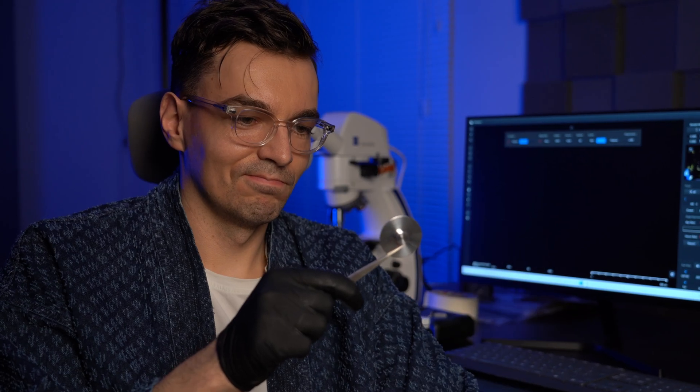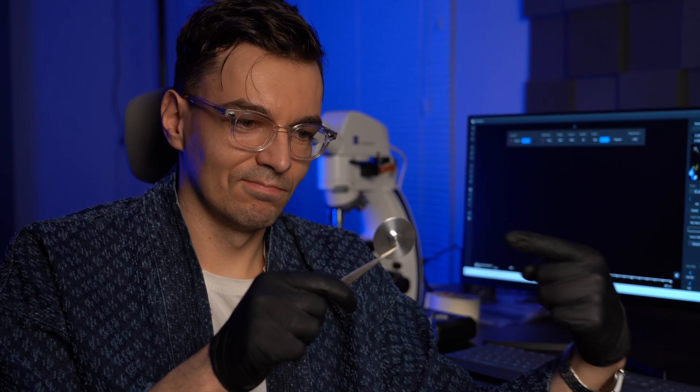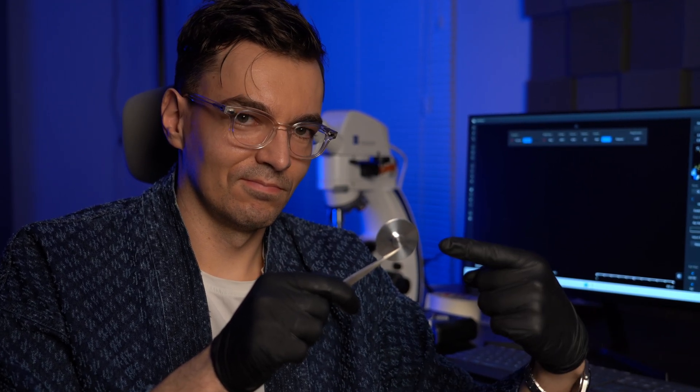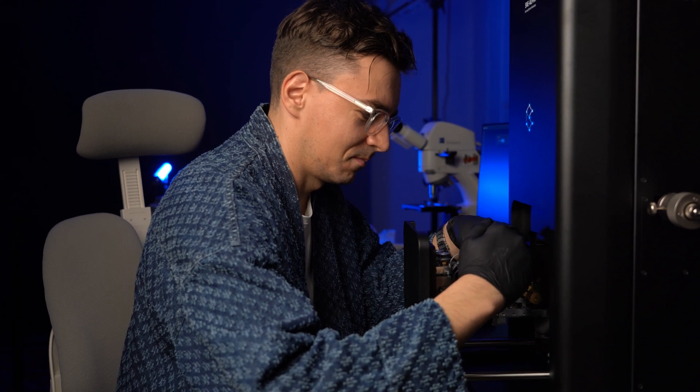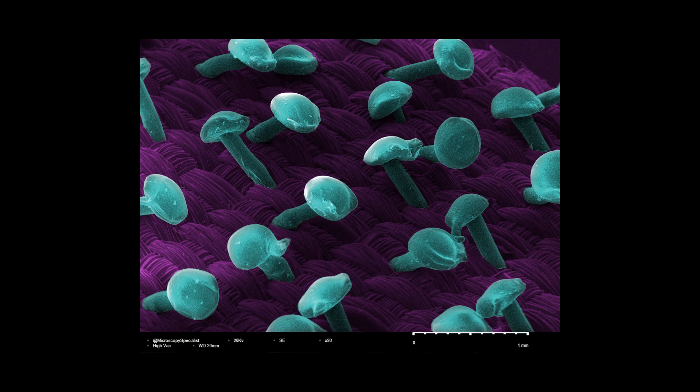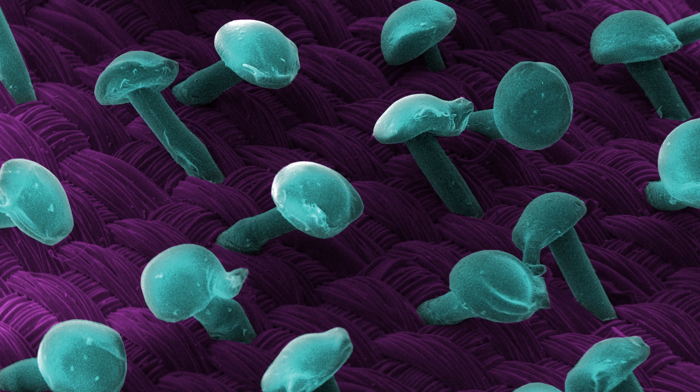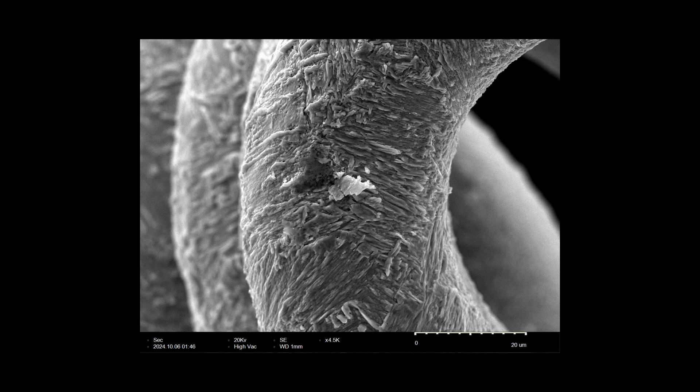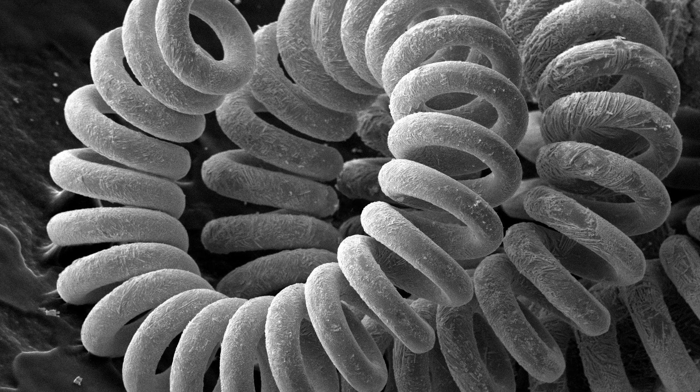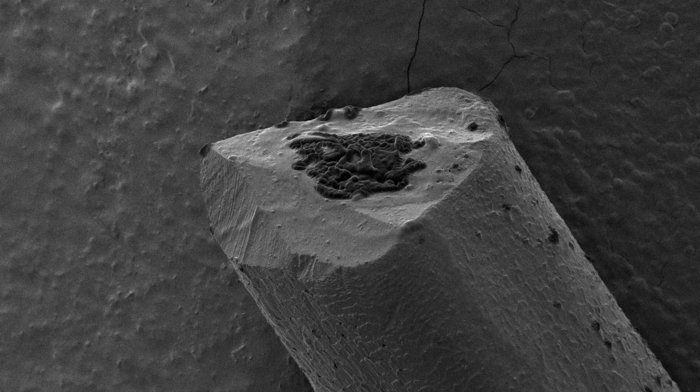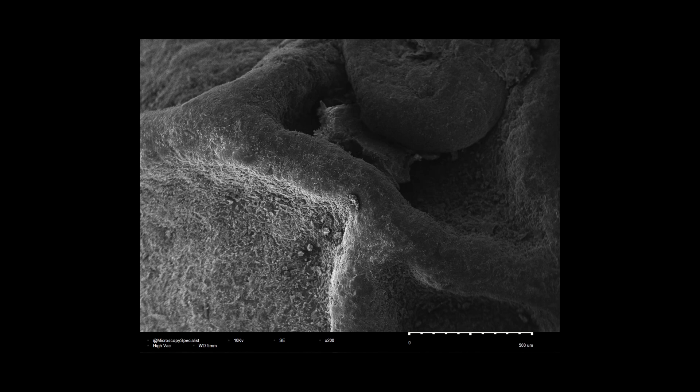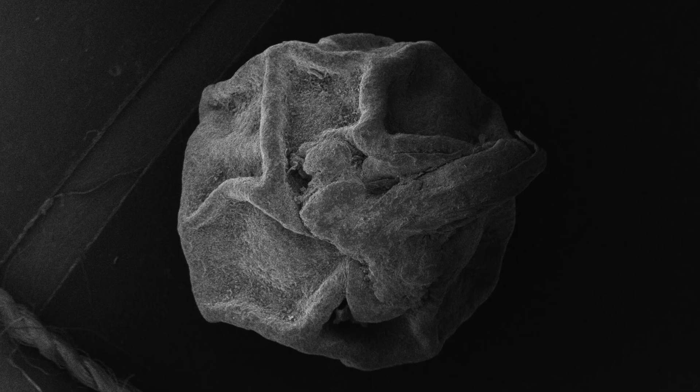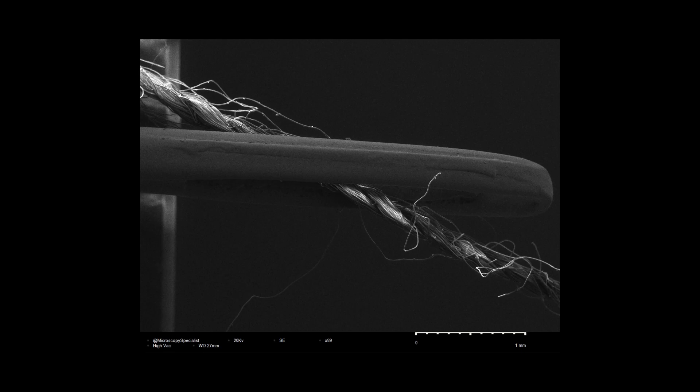I prepared this tab with the ordinary objects from our everyday life. Can you guess what these objects are? Let's try.